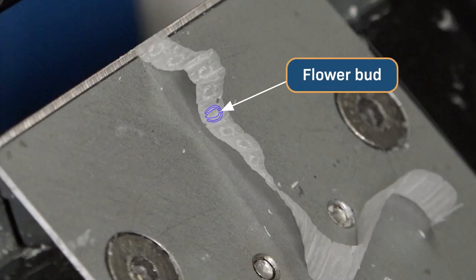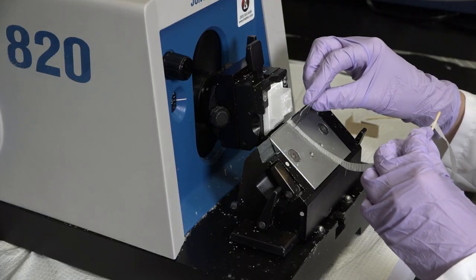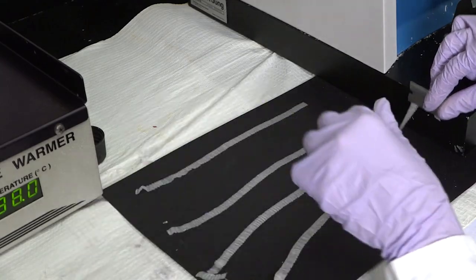And you can see the flower bud slice suspended perfectly in the wax. Behold the powers of the deli slicer of science. Now comes what I think is the most magical part of the process, transferring the ribbons to the microscope slides.